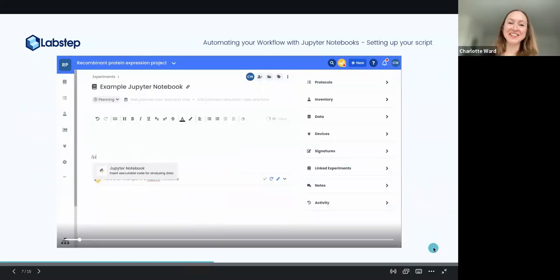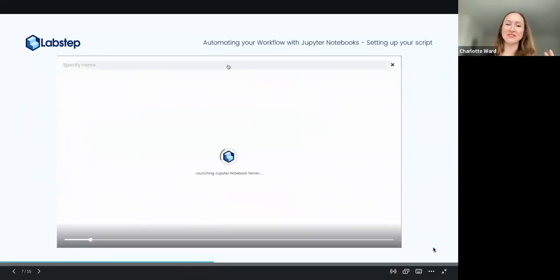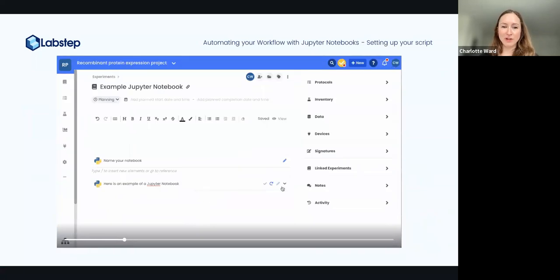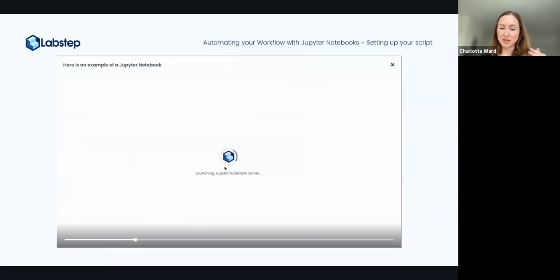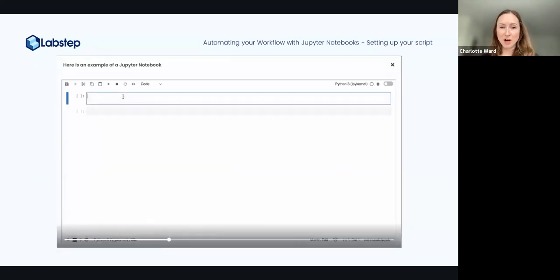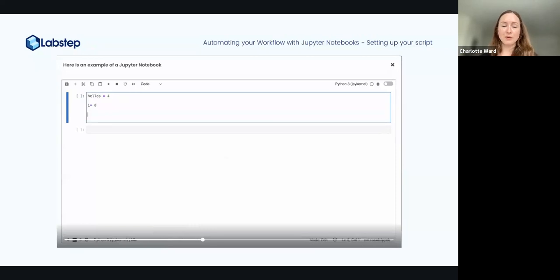Great, thank you. Yes, so what we're showing in this video is just how you get into the Jupyter Notebook environment within Labstep. What you saw there on the video is we just do this slash command, type in Jupyter Notebooks, and it will launch a new notebook for you. The server starts up, and then you've got this cell, which we're looking at now, where you can write some code. We've got a really simple script going in there right now, which gives you a really exciting output.